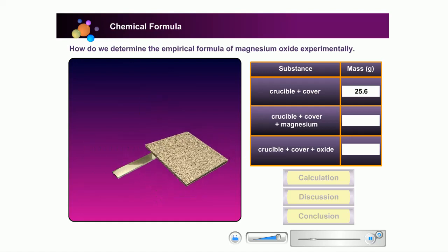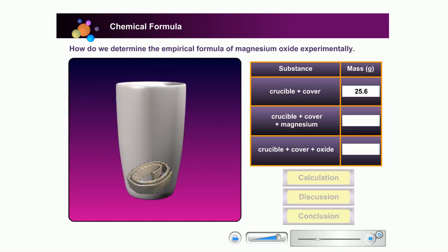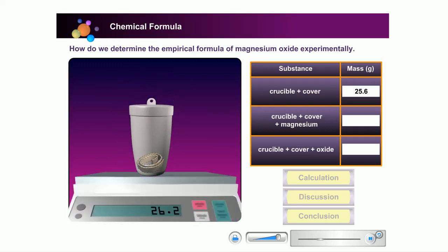Clean 5 cm magnesium ribbon with sandpaper. Roll it loosely into a coil. Place the coil in the crucible and cover it. Weigh and record the mass. Key in the mass in the table.